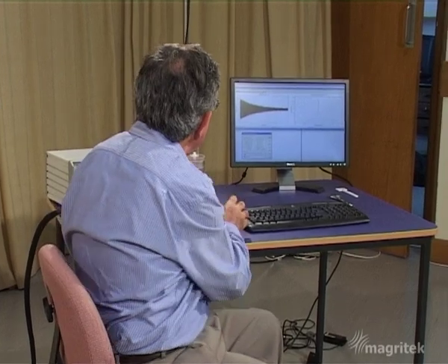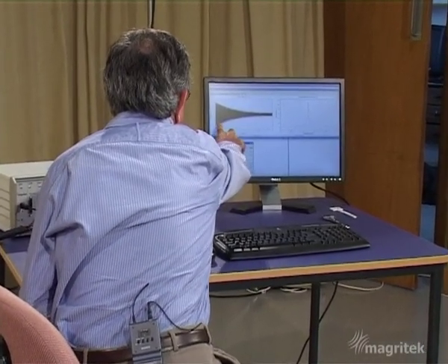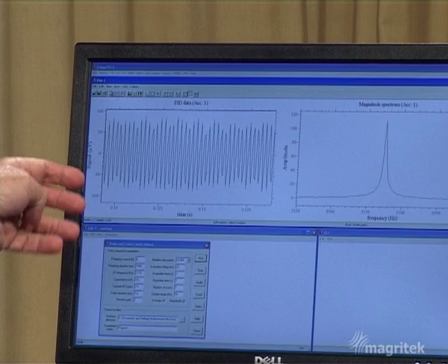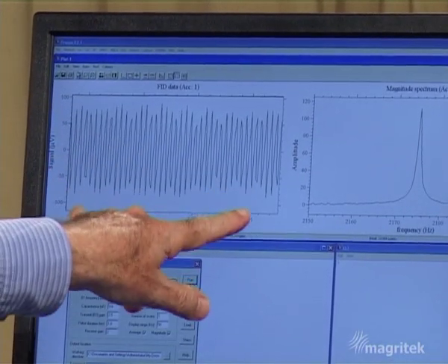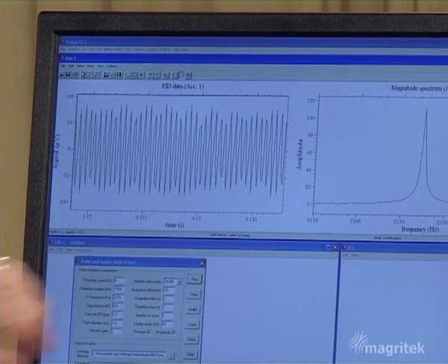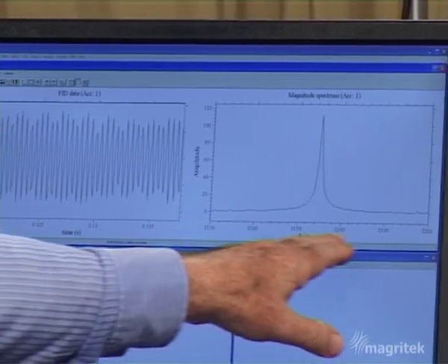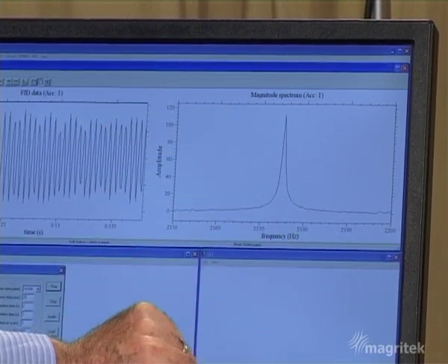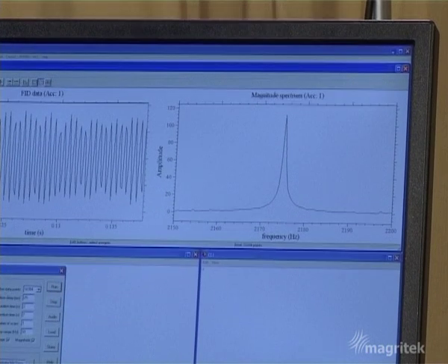And now we have the excitation and the decay of that oscillating signal, the free induction decay, over a period of about 0 to 2 seconds. Let's zoom in on that free induction decay and see if we can see the oscillation. There it is. A very clear oscillation revealed over the shorter time window. So that's known as the time domain. If we perform a Fourier transform on that time domain data, we get the spectrum. And that spectrum lies in the frequency domain. In the right-hand panel, we can see that spectrum. It corresponds to a definite peak, which is centered at about 2.17 kilohertz.